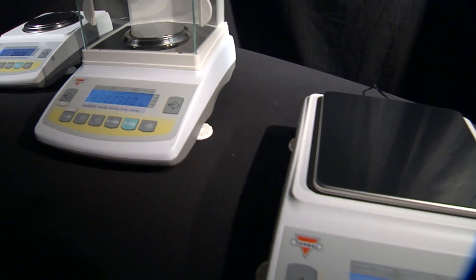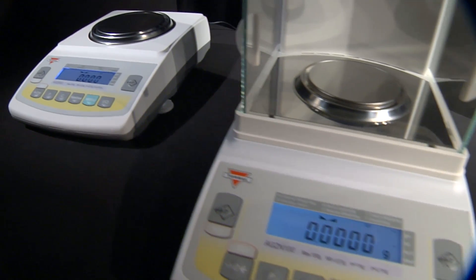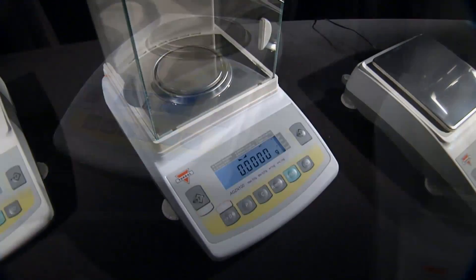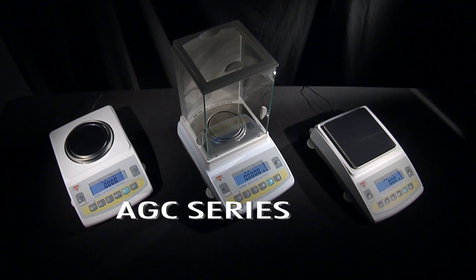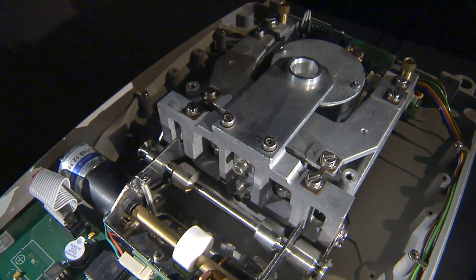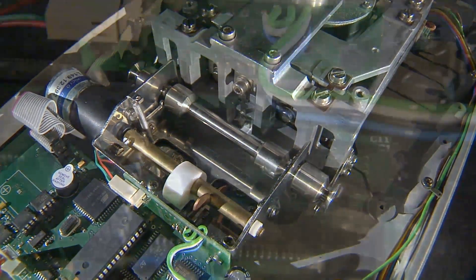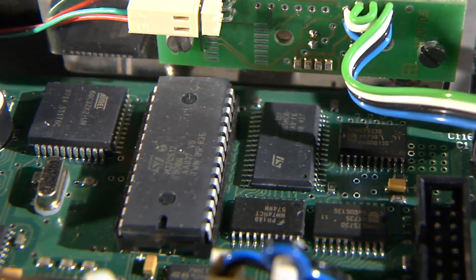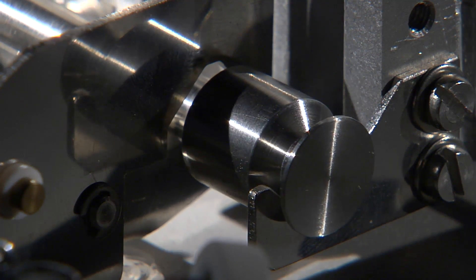Introducing the AGC Advanced Series — a new rigid modern design with upgraded functionality and guaranteed reliability. All AGC scales feature Torval's most advanced electromagnetic load cell, powered with a 32-bit processor, as well as internal automatic calibration, providing optimum weighing accuracy.